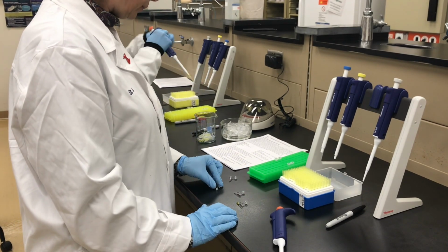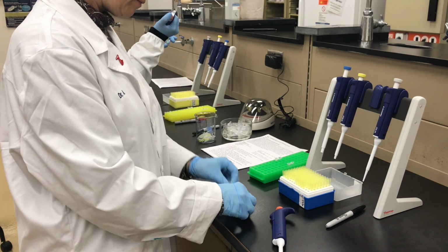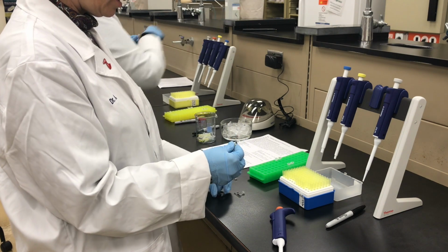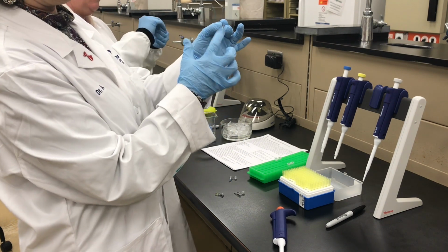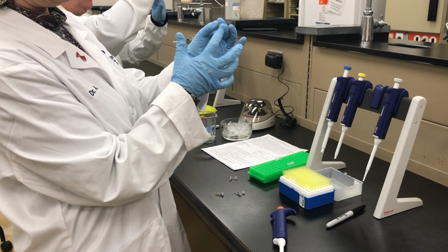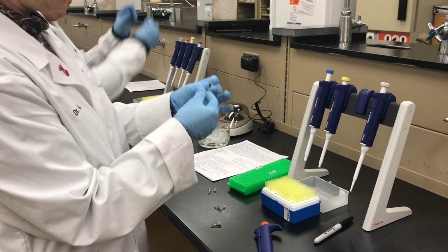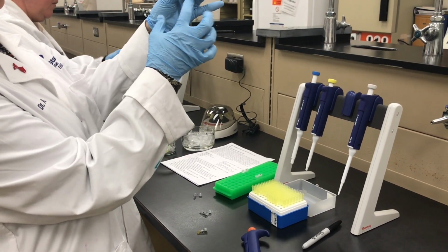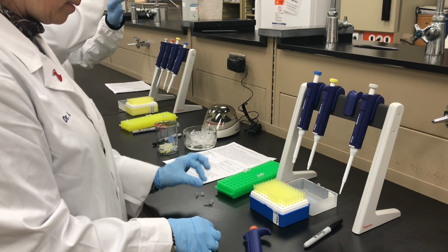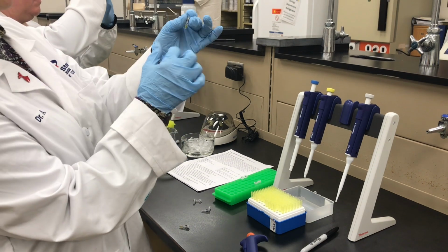So now, step 4, make sure the lids are tightly closed. And flick to mix. This is what it looks like. I'm going to make sure that white ball is totally dissolved and everything is mixed well. I'm going to do that another time. Flicking tube.